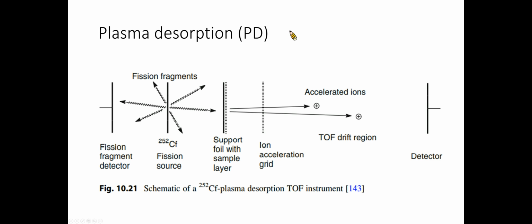Based on how it was used, PDMS is rather the precursor of matrix-assisted laser desorption or ionization (MALDI), based on the principle of ion generation. It is closer to secondary ion mass spectrometry and fast atom bombardment.